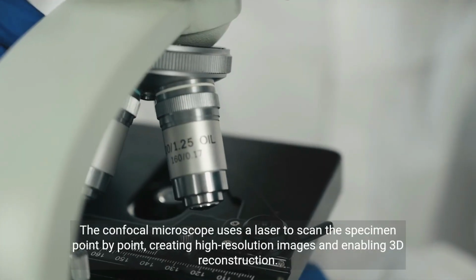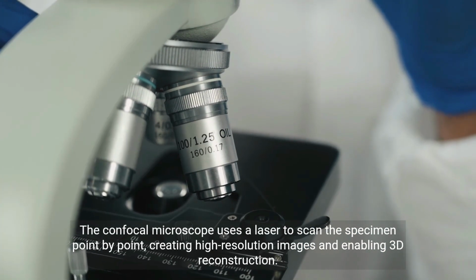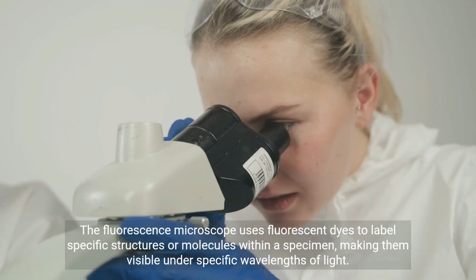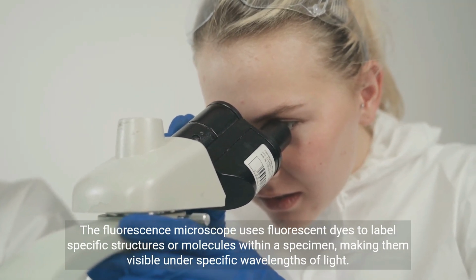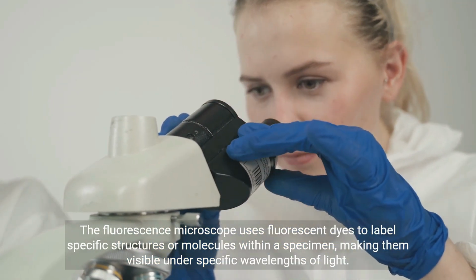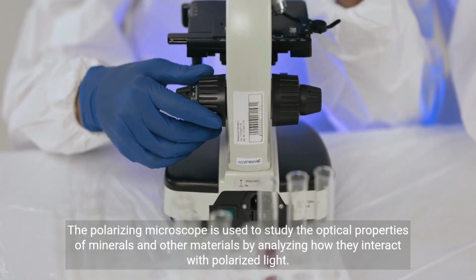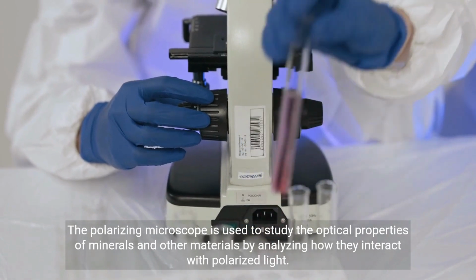The confocal microscope uses a laser to scan the specimen point by point, creating high-resolution images and enabling 3D reconstruction. The fluorescence microscope uses fluorescent dyes to label specific structures or molecules within a specimen, making them visible under specific wavelengths of light. The polarizing microscope is used to study the optical properties of minerals and other materials by analyzing how they interact with polarized light.